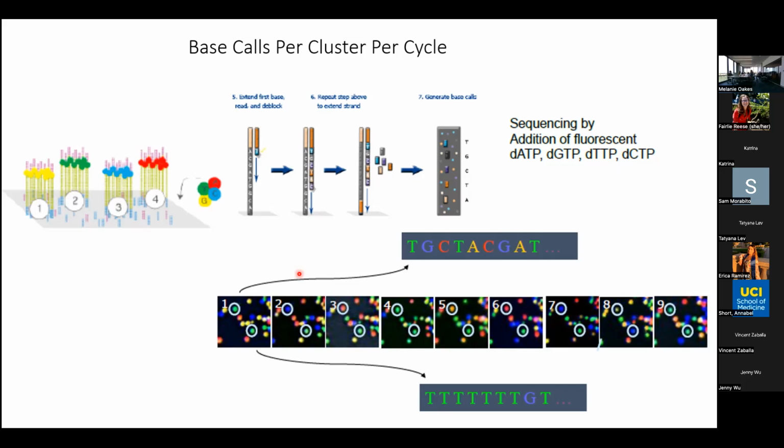So you may come to me and say, I only want single read. Yeah, you're going to get paired-end. Just don't take the extra paired-end read if you don't want it, because it's a lot less expensive for you. We could do single read on this SP, or S1, wherever the SP is, but it's going to be a lot more expensive for you.